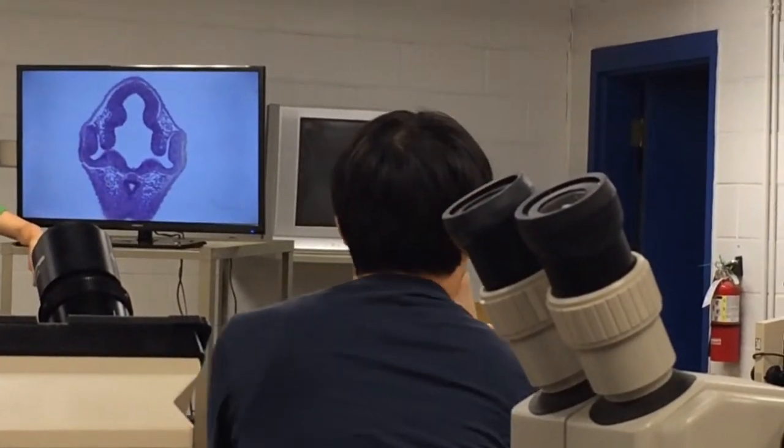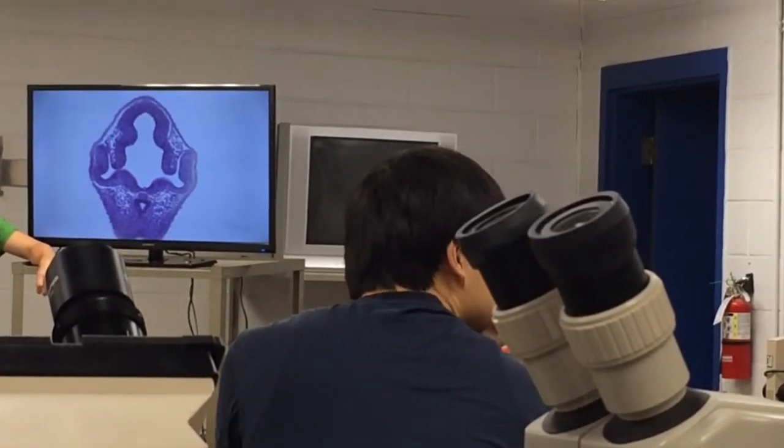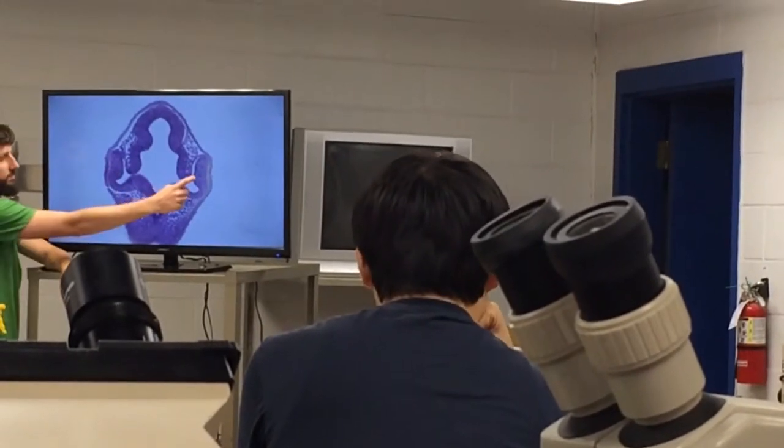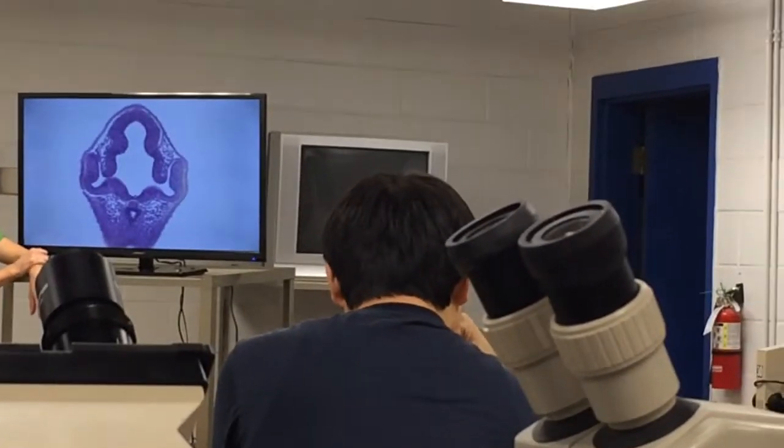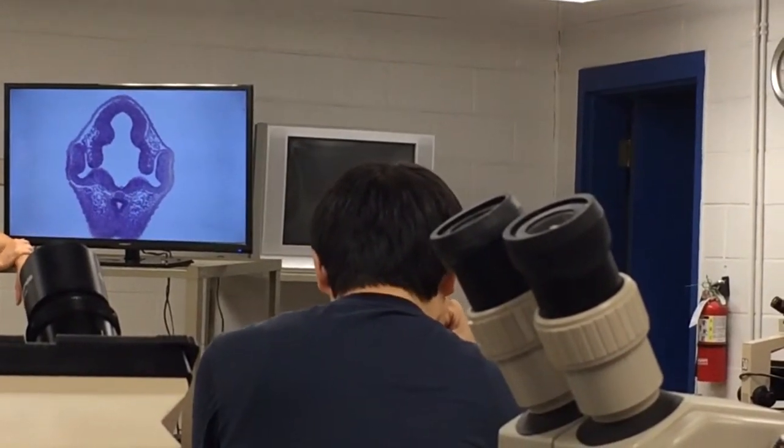Now why are you going to be sure that that's the forebrain? Which structure grows out from the forebrain on each side? Look at it. Touch optic cuffs, optic cuffs and optic vesicles and see where it's connected. These are absolute vertebrate markers, period.